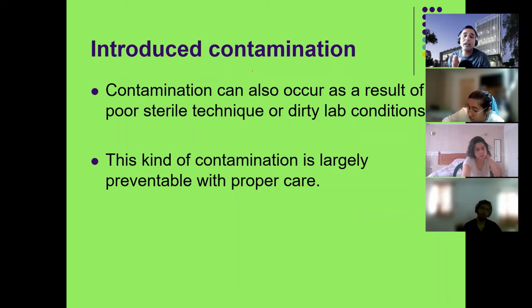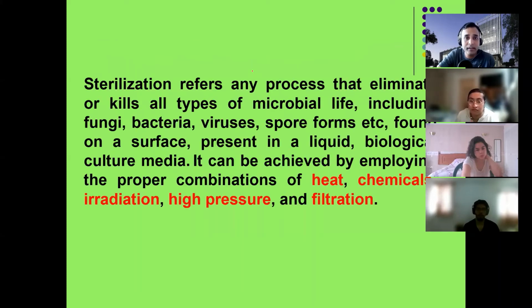Labs are generally extremely clean. They are well balanced, and the mobility of people is very controlled. All the people entering and coming out are totally covered. I will show you some videos where you can understand how the process goes depending on the level of safety, 1, 2, 3, 4.